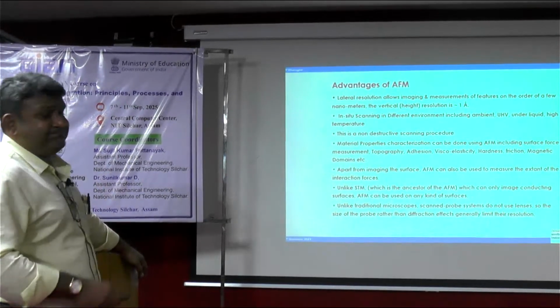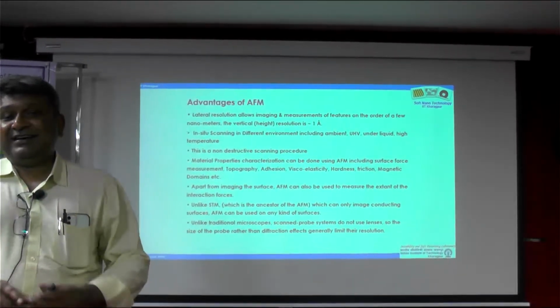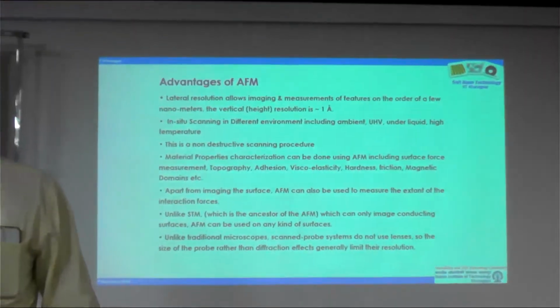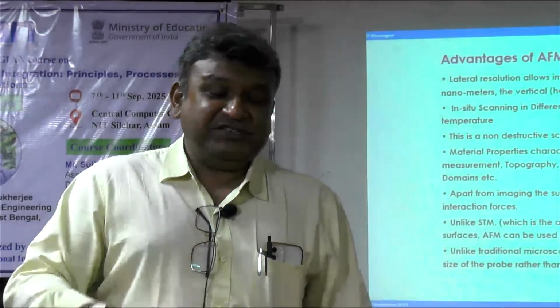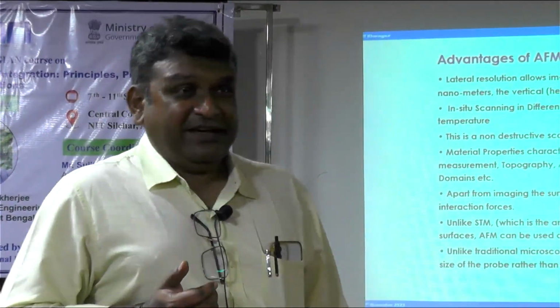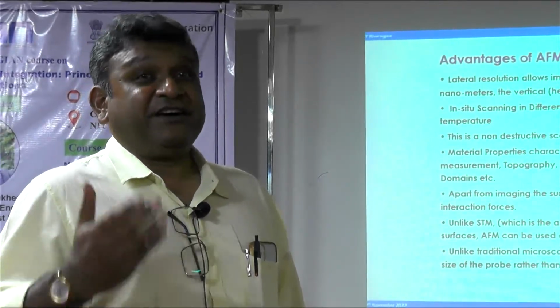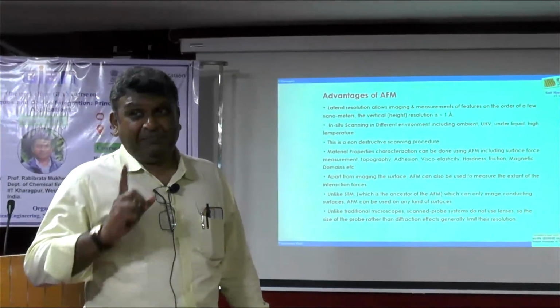So basically that's all what I wanted to teach you. I hope you have learned something, that the atomic force microscope is of course an instrument, and you now understand it's a very interesting type of microscope which does not capture a picture but actually captures data, with which you do not lose the information about the third dimension which you otherwise lose in any microscope or any picture, right?